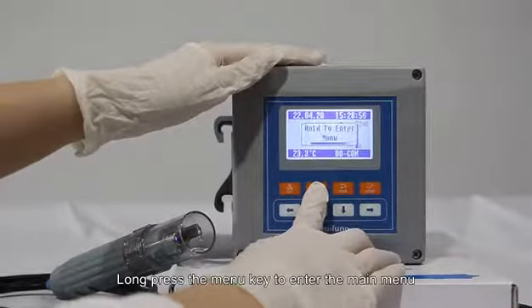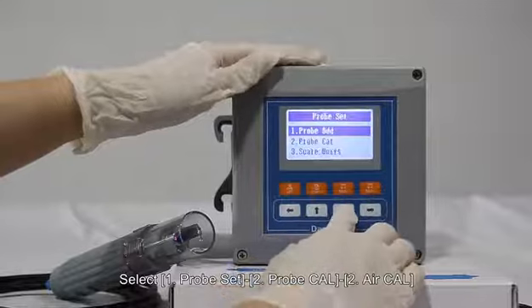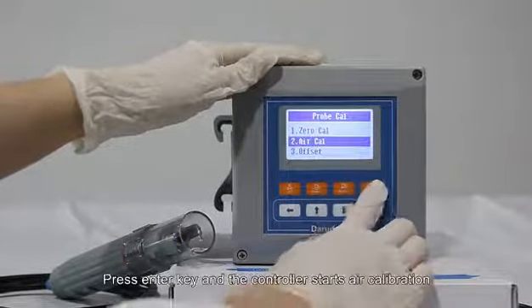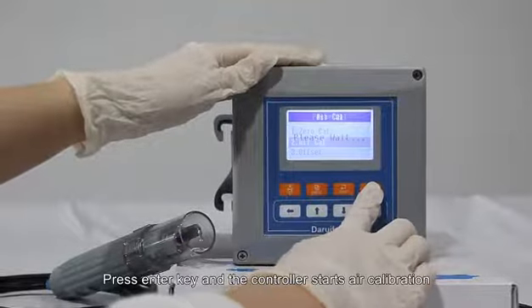Long press the menu key to enter the main menu. Select 1, Probe set, then Probe cal 2, Air cal. Press enter key and the controller starts air calibration.